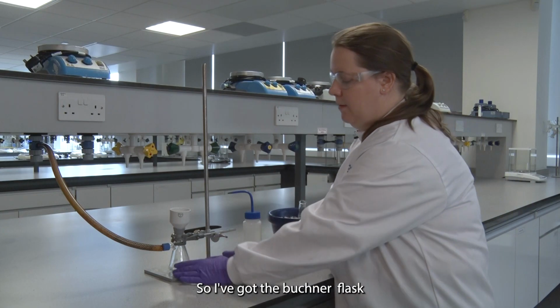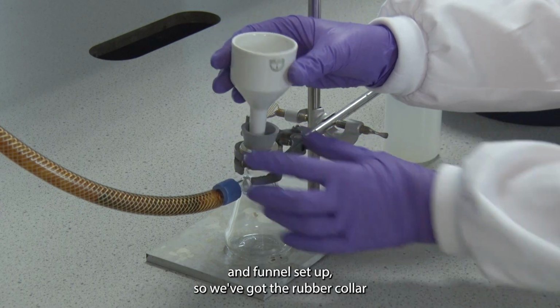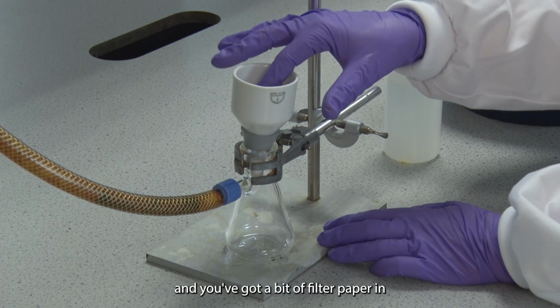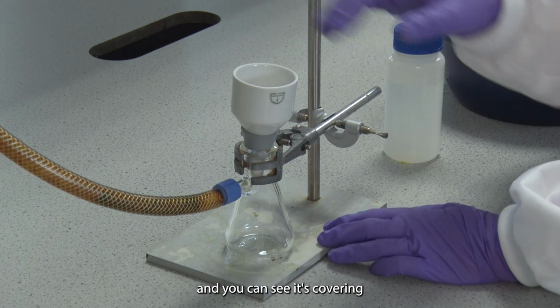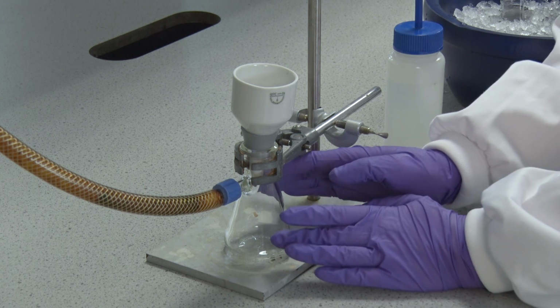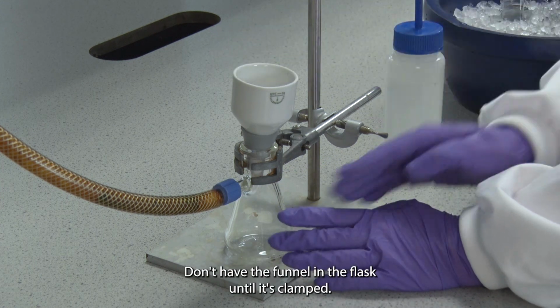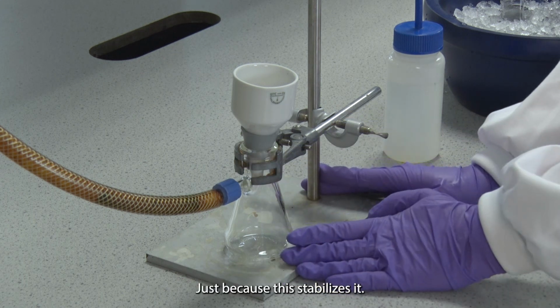So I've got the Buchner flask and funnel set up. We've got the rubber collar that the Buchner funnel sits in, and you've got a bit of filter paper in, and you can see it's covering all of the holes in the funnel. The flask is clamped, okay? Don't have the funnel in the flask until it's clamped, just because this stabilises it.